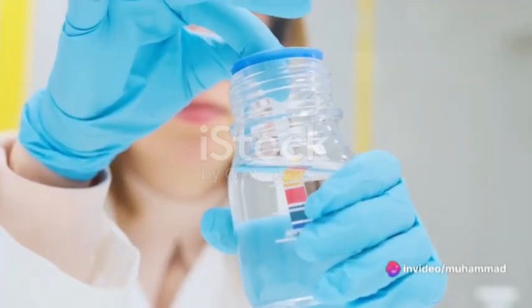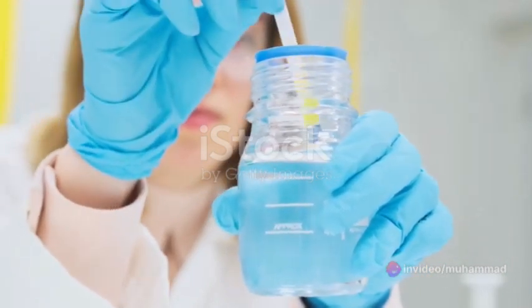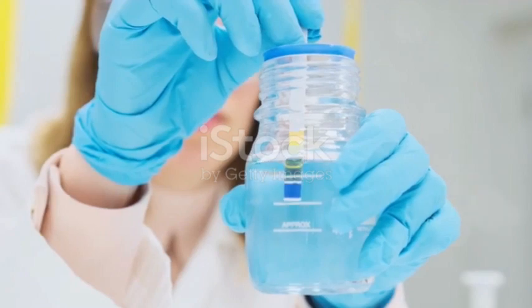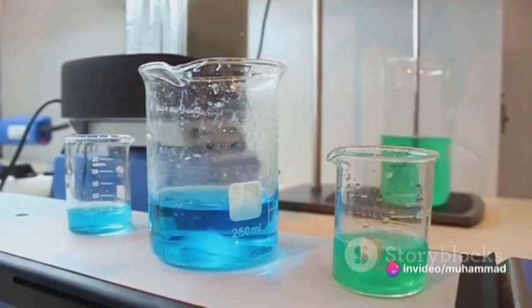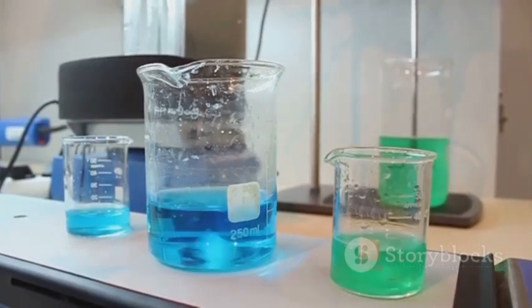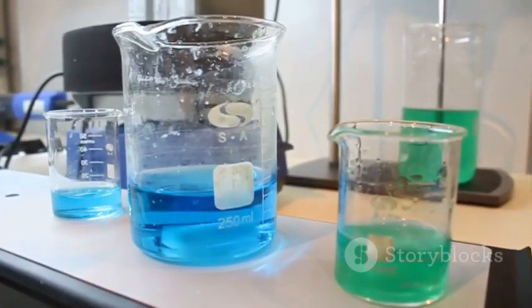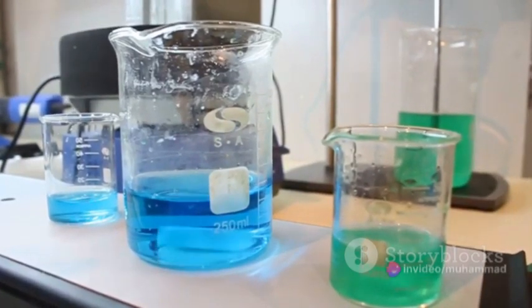The magic, however, lies in the addition of an indicator. An indicator is a chemical that changes color at different pH levels. It's like a chameleon, morphing and shifting to signal the nearing of the equivalence point. The moment when the indicator changes color is a sight to behold. It signifies the completion of the titration, the point where equal amounts of acid and base have reacted. This change is the grand finale, the denouement of the performance, marking the end of the acid-base titration.